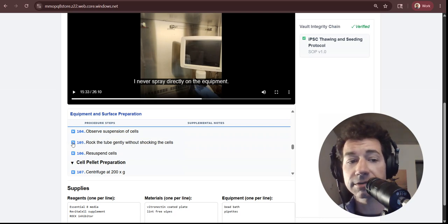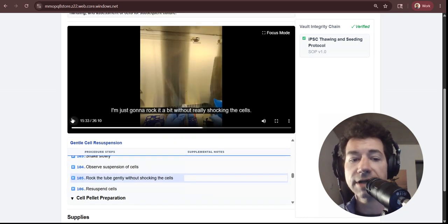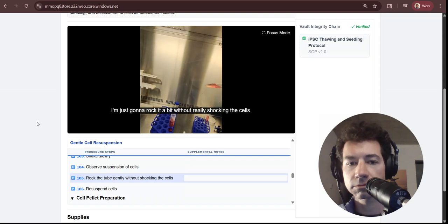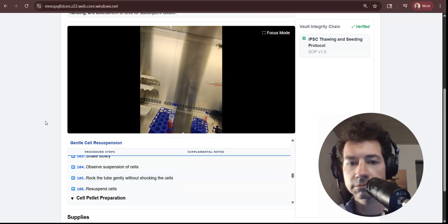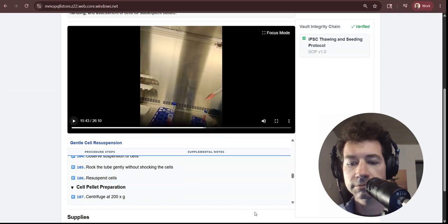They click the play button, it moves the caret of the video directly to that step, and now they watch. What does the author actually mean when they say rock the tube gently without shocking the cells? I'm just gonna rock it a bit without really shocking the cells. It's right there. My cells are resuspended. Now we can see exactly what they meant by rocking the tube gently.